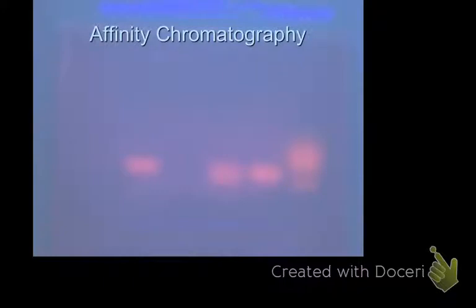in order to put an antigen on it. And so whenever you're making your gene, what it's going to look like is it's going to have either at the N-terminus or C-terminus, whatever the antigen, for example, maybe it's MYC, or there's lots of them out there, but there's some type of antigen there. You have to have another little linking area and then the gene for your protein. So this is what we're wanting. And then, of course, the rest of the plasmid or the chromosome, usually it's plasmid or cosmid. But in between the here and here, you need to put in some type of protease spot.